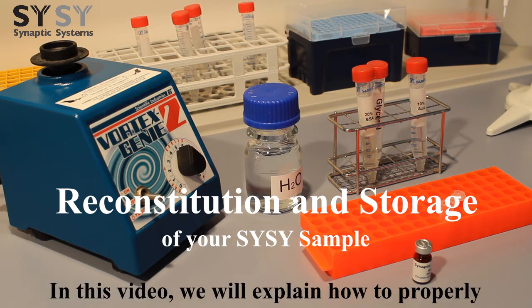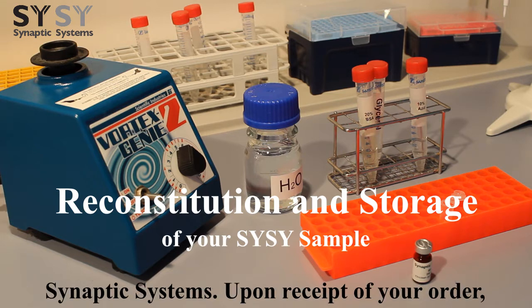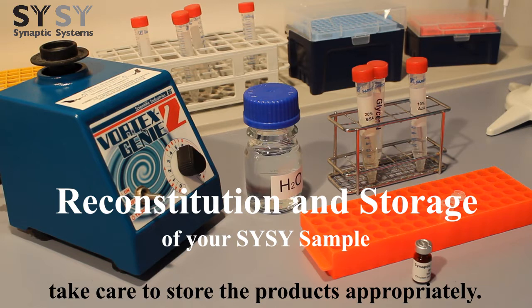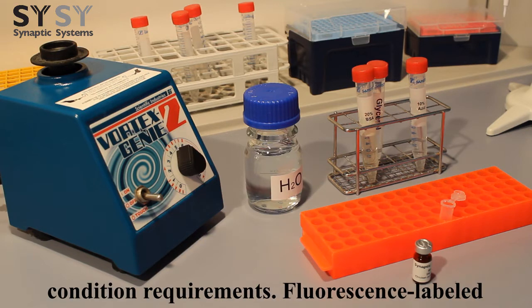In this video, we will explain how to properly reconstitute and store your sample from Synaptic Systems. Upon receipt of your order, take care to store the products appropriately. Different products have different storage condition requirements.